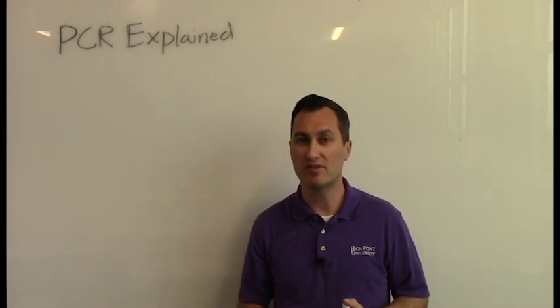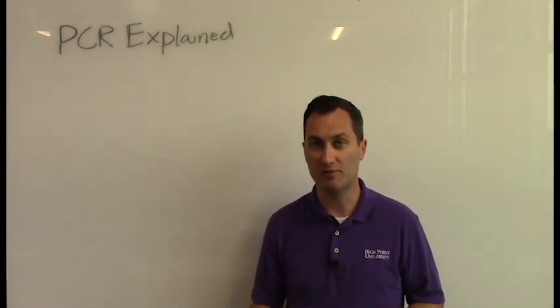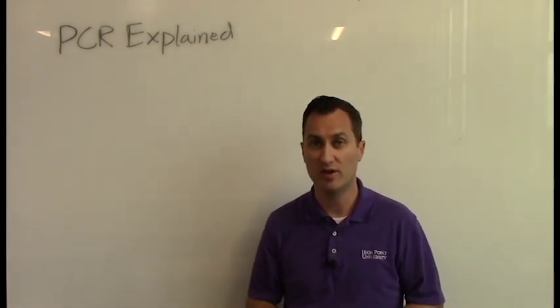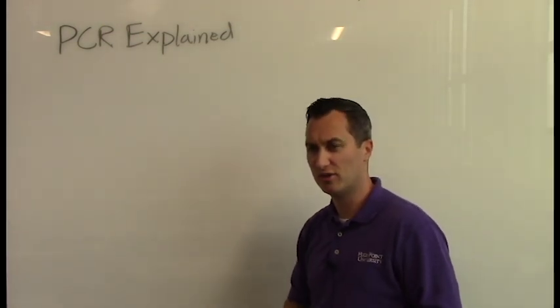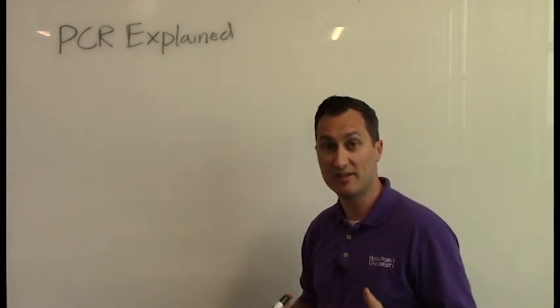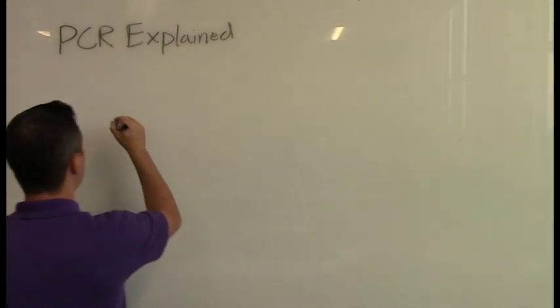But much fewer students have a really firm understanding of what's going on at the chemical level of PCR and can adapt it to different situations. Okay? So this will serve as a primer for that ability. So first thing to understand is that there's 3 basic conditions in PCR, and it's driven by temperature changes. And those 3 temperature changes are as follows.